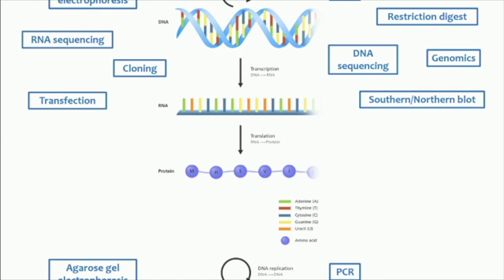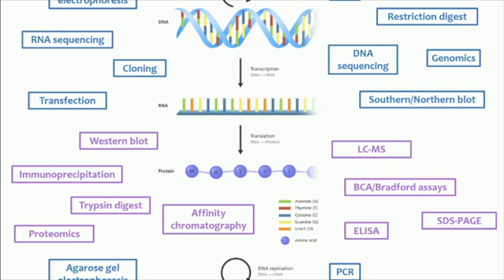Proteins have a similarly wide array of techniques you can use. I've listed some of them out here. I'm going to mention probably most of these, at least by name, but I won't go into crazy detail about what they all are for. Some of them are meant for protein detection, some are meant for quantification, some are meant for analyzing proteins, like the structures of proteins and the sequences of them. So this is where we're starting, a huge variety of techniques to touch on, at least briefly.